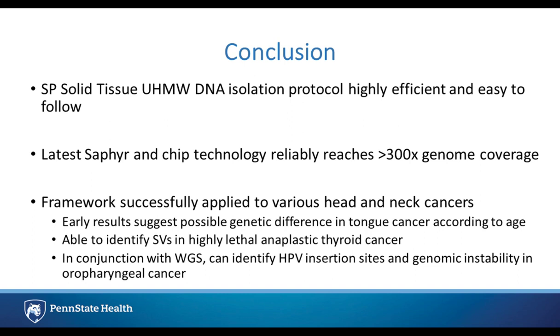So for tongue and thyroid, I used the rare variant pipeline because with the SP tissue, I was able to achieve greater coverage of the reference. So with 300x, I can then use that rare variant pipeline and see what types of variants are there, including ones that are quite rare, which you might miss with lower coverage. The filtering for those, I used the most stringent settings possible for the Bionano control. Bionano has reference genomes, and you can set it so basically any structural variants that you see are not present in any of the Bionano controls, and that's what I use for those.